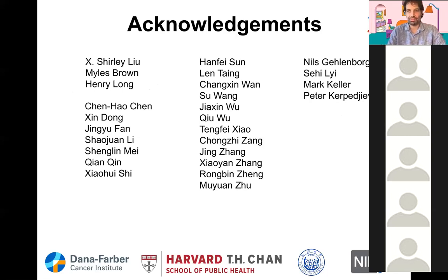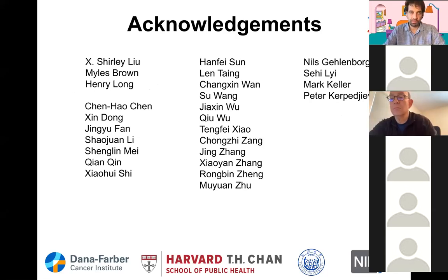Thank you, Cliff, for that summary. I want to make a comment about LISA input. Basically, we look at the differential gene expression and you input that gene list into LISA. Usually, we want this list to be not too small. For example, if you only have 5 genes that are differentially expressed, it's very difficult for us to figure out the lineage. But if you have a few hundred genes that are differentially expressed, based on the differential gene list, we can almost guess what cell type it is, what lineage it is from. And that's what helps LISA to build the epigenetic model.